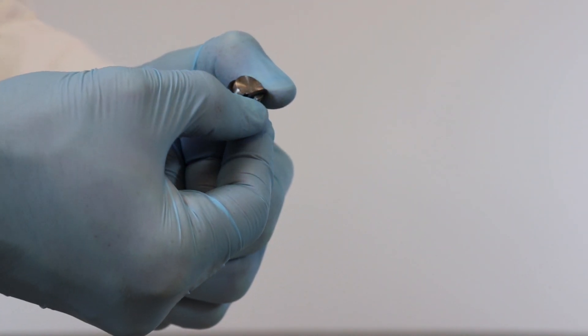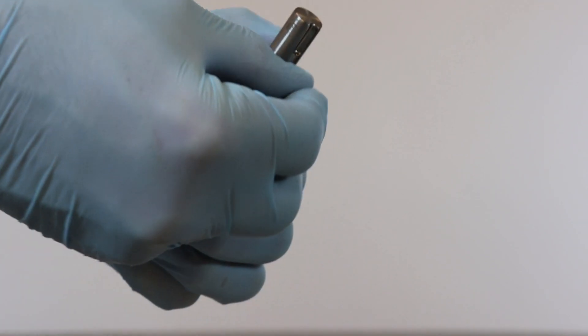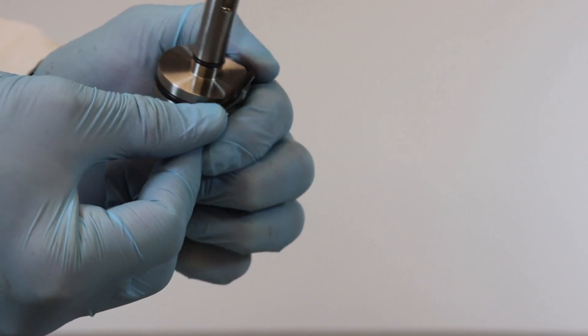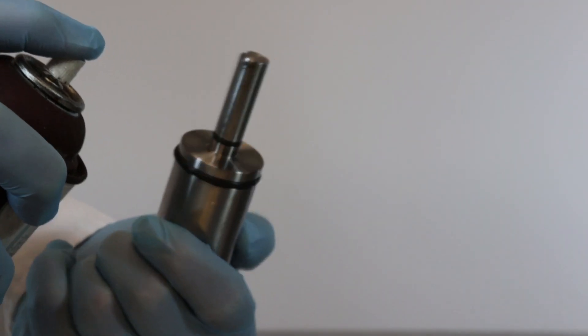Slide a number 12 Viton O-ring into the notch on the long rod of the rotary piston. Then slide a number 218 Viton O-ring over the long rod side of the piston, fitting it into the notch. Spray both O-rings with silicone.